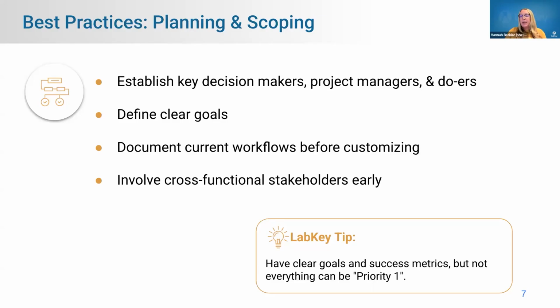And so having someone in meetings that's able to understand who the final users of the LIMS are, in order to answer those questions quickly, can help with the implementation cycle because we're not then waiting on having another meeting or going back and forth on email. Making sure that the people that are most knowledgeable and also have the ability to make a decision are aligned and in the same room is very helpful. Also making sure that there's some type of project management.